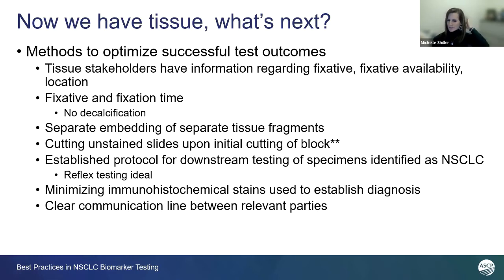At your individual institutions, there are the key players who manage the tissue. There are people, like maybe you have interns and residents at the institution, or nursing staff, who bring tissue to the lab. So it's important to have SOPs for them, and maybe have training sessions on a regular basis, or have a way for nursing staff and ORs to train new nurses and let them know where we keep our fixatives, especially for those specimens that may come in after hours.